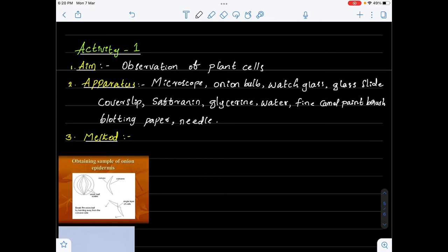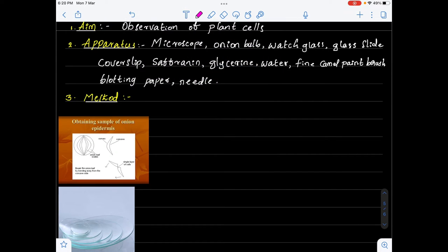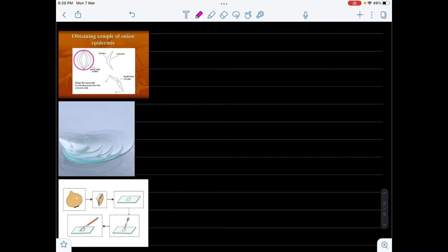Now let us come to the third step, that is method. First we need to take one onion bulb. We should cut a small piece from this onion bulb. Here I have taken a cut piece of onion, and we can see that there are many layers. So we should separate out a thin onion peel from the concave side.